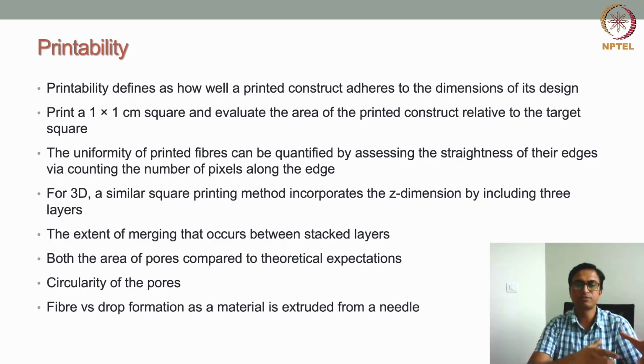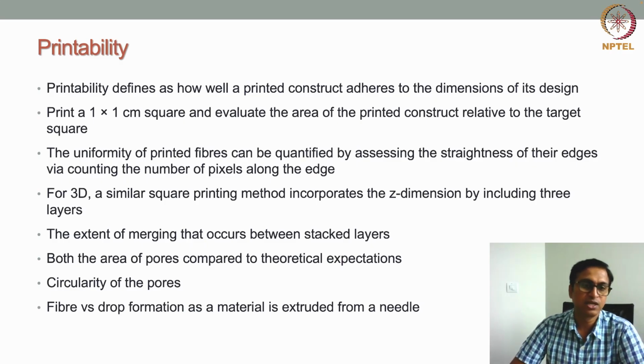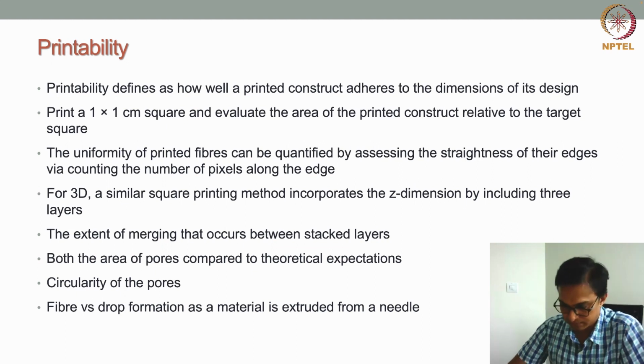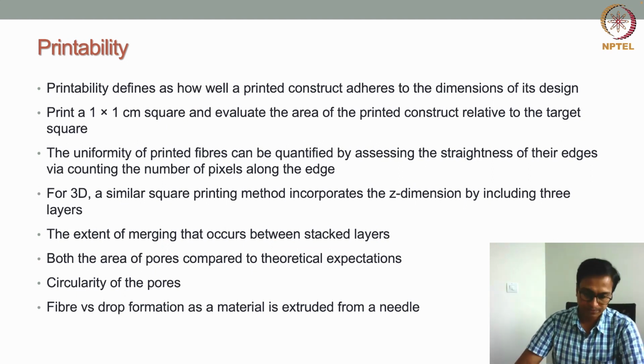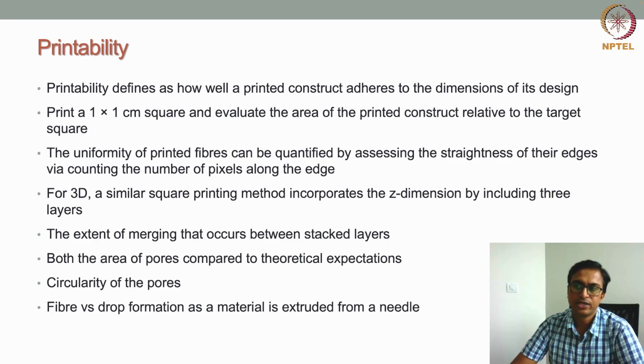Otherwise, as per the design that is a rectangle, but you end up having a circular pore. That is not acceptable for bioprinting, because that bioink cannot provide good printability. That means you cannot print a very good structure, or the print fidelity would not be that great.